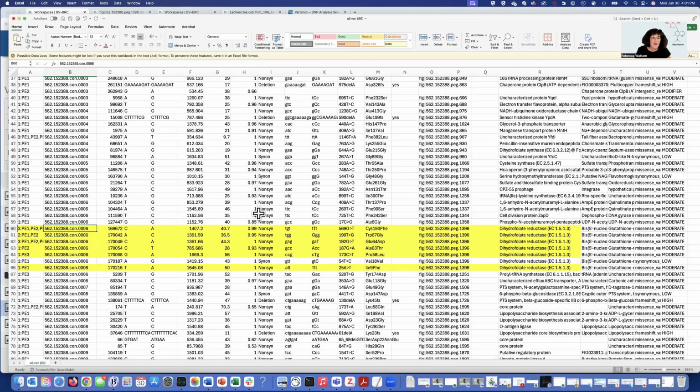Also, I always pay very close attention to how deep the coverage is at these locations. Now, some of these you're going to have to look at on an individual basis when it's combining several of them together to show the depth of it. But this is giving you a good indication.